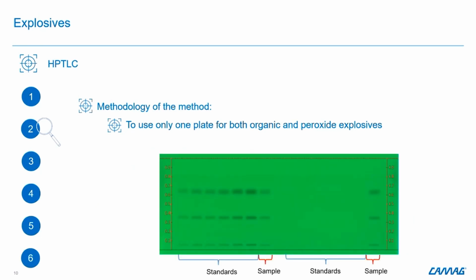Here is one example of the plate that we have done. You see that on the left side, we have applied some samples and standards, and on the right side, we had applied also some standards and some samples.